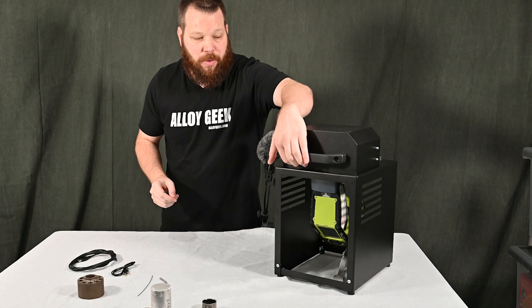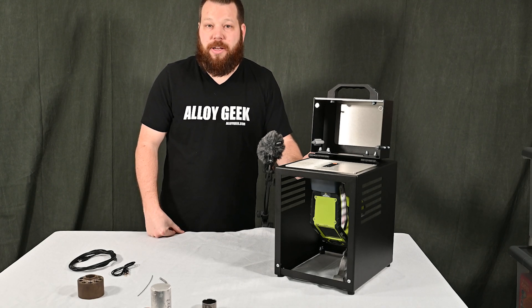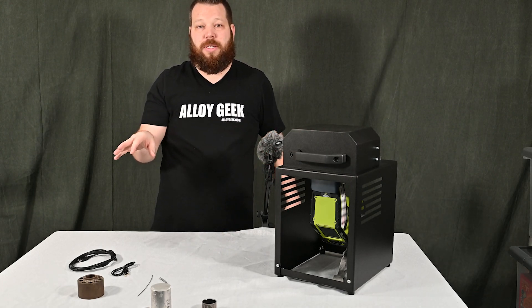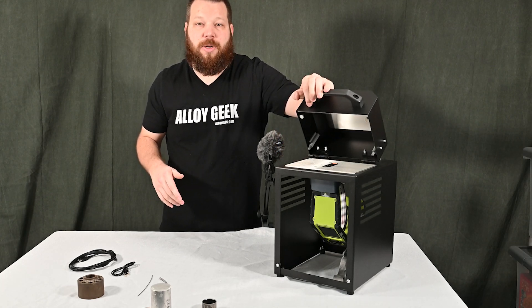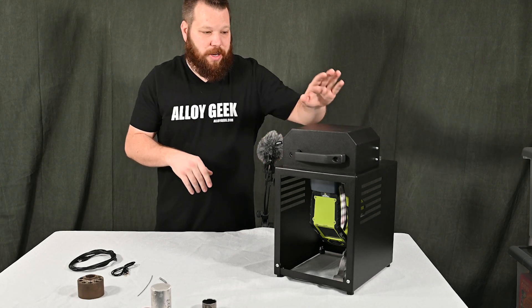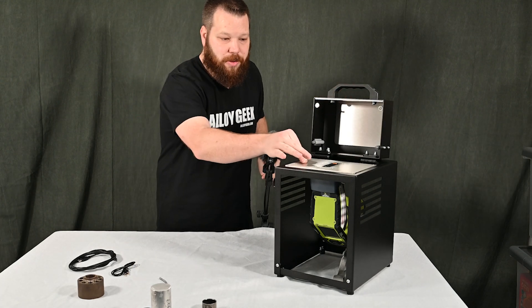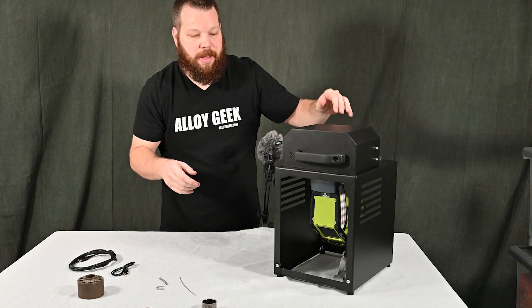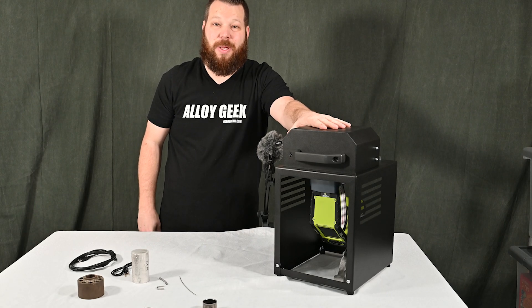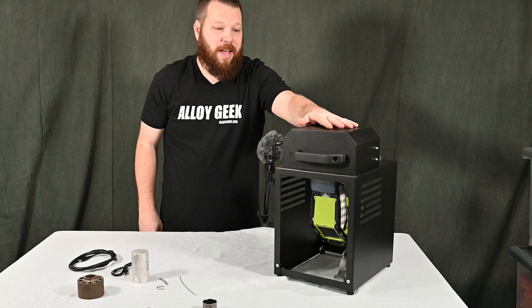There's just one port on the back for the jumper cable, which makes it really easy. For jewelers I would always recommend this test stand over the mobile — you have a larger area to work from and you can easily target your samples. The legacy technology of having to plug into a wall is gone. It uses the same RFID technology as the Niton XL2 and XL3T: if you open this while connected with the jumper cable, it disables the analysis immediately and keeps you and your customers safe. These are available to ship immediately from AlloyGeek.